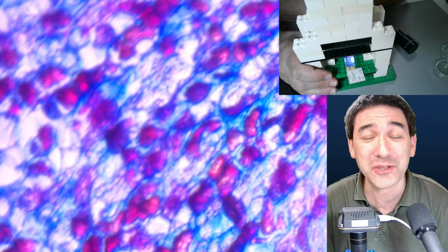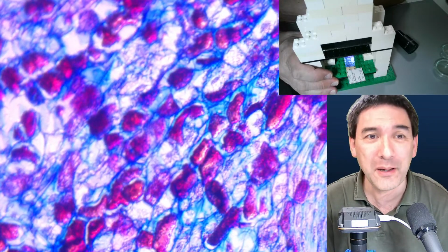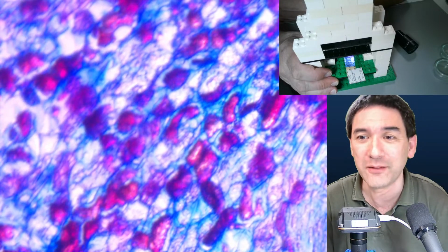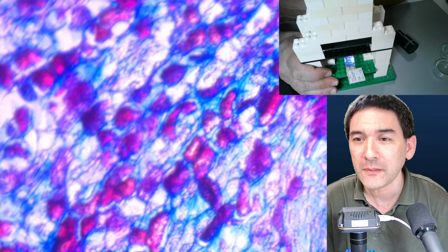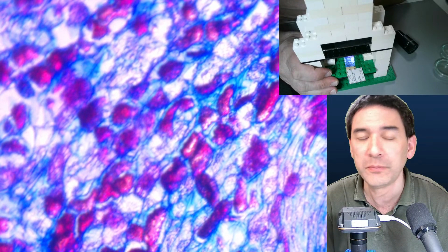But it's not possible to make your own optics. I think if you want to have reasonable quality, you have to simply buy yourself an objective. Wouldn't you also get an image if the distance is shorter or longer? Of course, the magnification would be lower or higher.